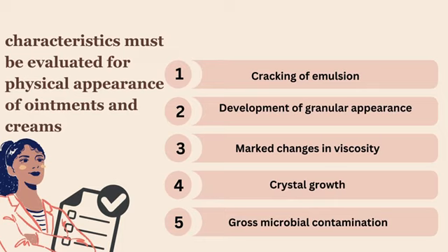Characteristics must be evaluated for physical appearance of ointment and cream. 1. Cracking of emulsion. 2. Development of a granule appearance. 3. Marked change in viscosity. 4. Crystal growth. And the last one, gross microbial contamination.